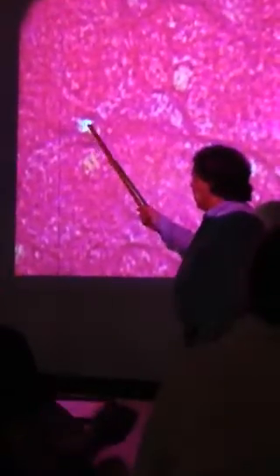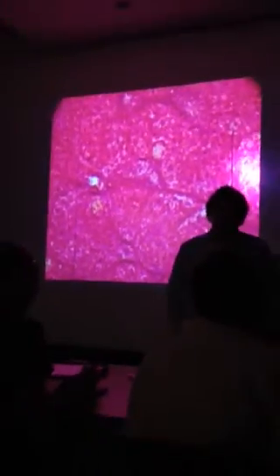See that little thing? That's a bile canaliculus. This is a high mag of hepatocytes, and what you're seeing there are the little channels, like right there, in between. Here's a hepatocyte. Here's a hepatocyte. All these little channels. Those are bile canaliculi. Those are the little tiny channels that carry the bile in between the hepatocytes.